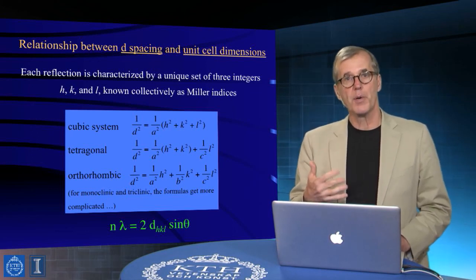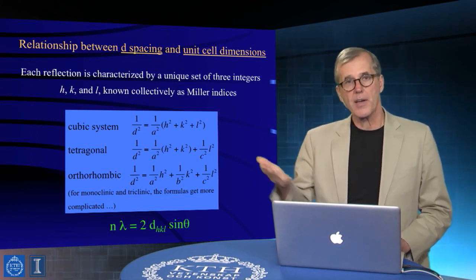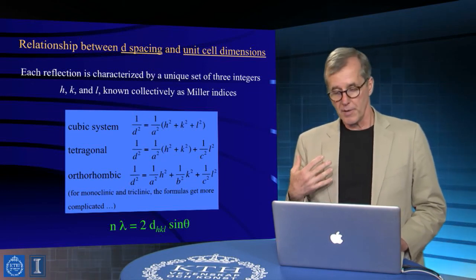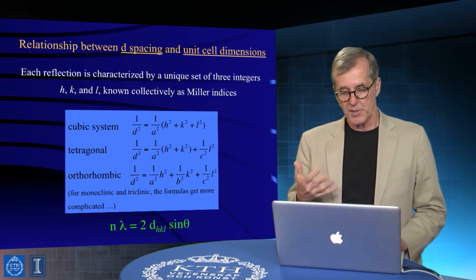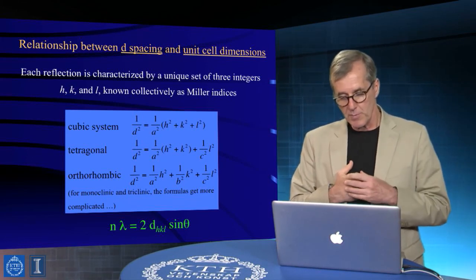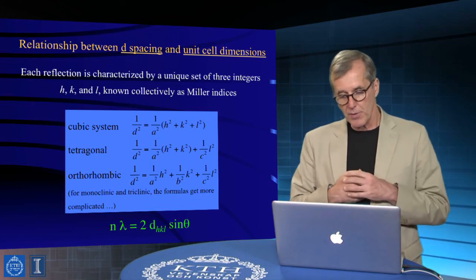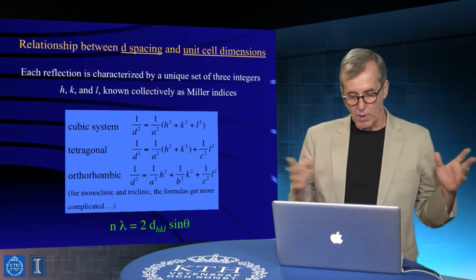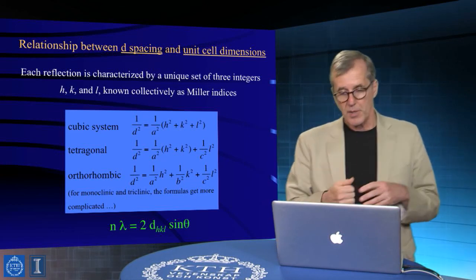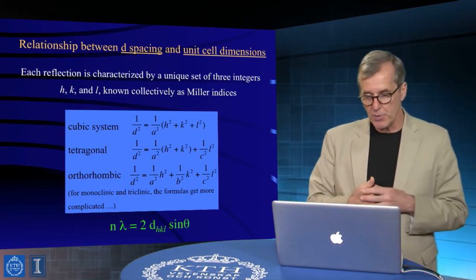And there's only, it's a large number, but there's a finite number of symmetry elements that exist, and a finite number of crystalline forms that exist, and symmetry systems that enable crystallographic forms, and some are more common, others are less common. Some are relatively simple, and some are just wickedly complicated. Some of the important examples are shown here.